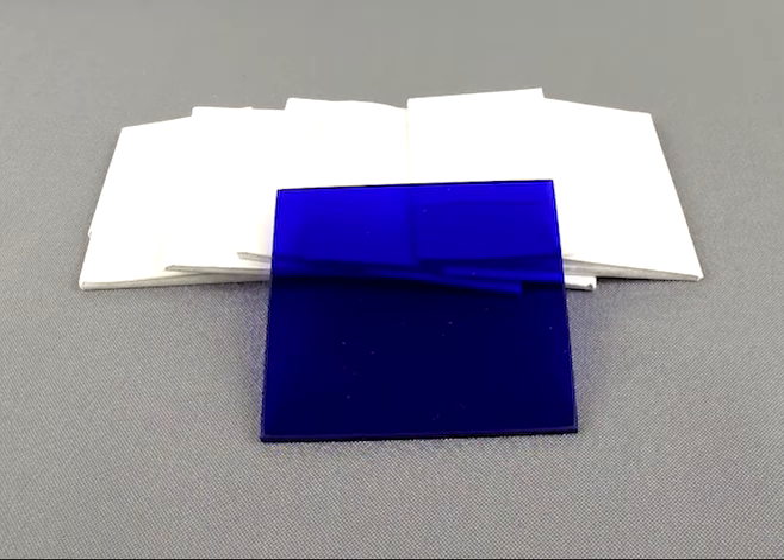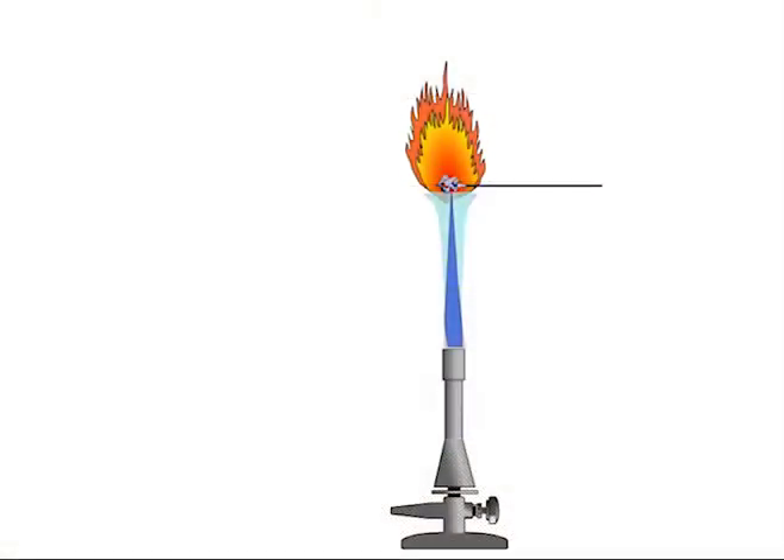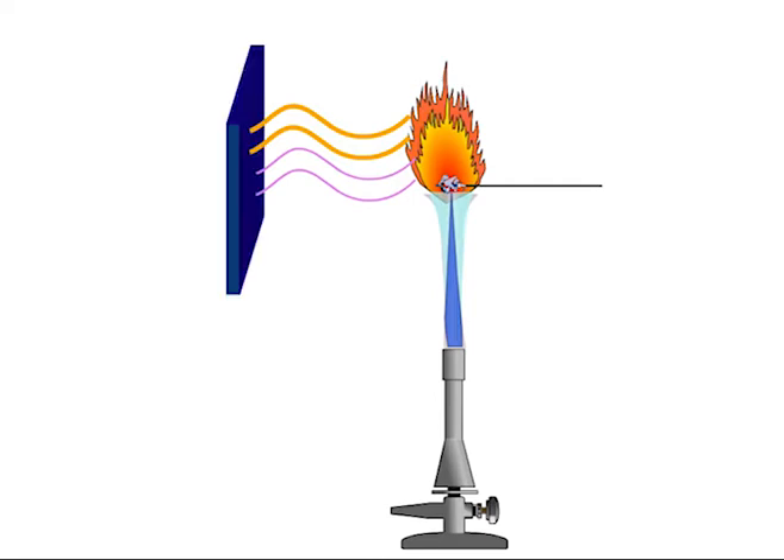For flame tests, it allows you to filter out other colors and focus on elements such as potassium, whose violet flame can be overshadowed by other brighter flames. When you place the salt into the flame, you get a large burst of orange, but there is actually an underlying tone of violet. The cobalt plate allows you to filter out the orange wavelengths so that only the violet associated with the potassium shows through.